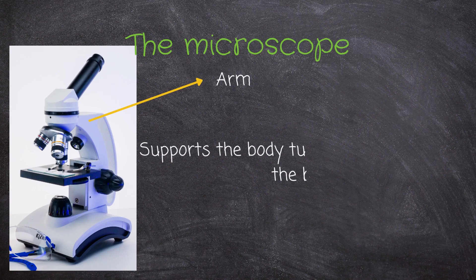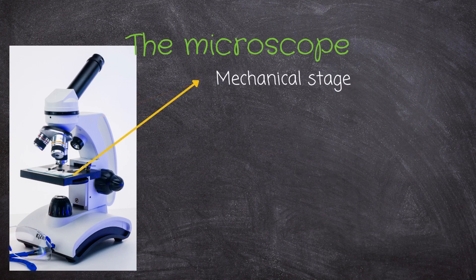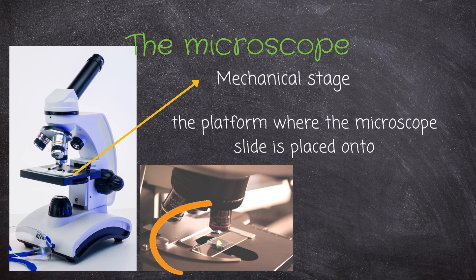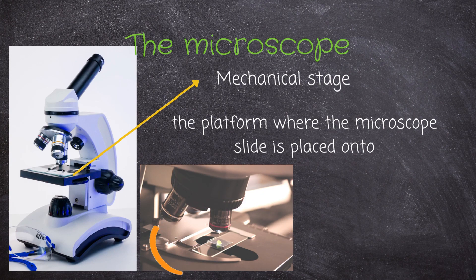Moving on to the arm, which supports the body tube and connects it to the base. It basically supports the whole microscope. Then we have the mechanical stage, which is the platform where the microscope slide is placed.